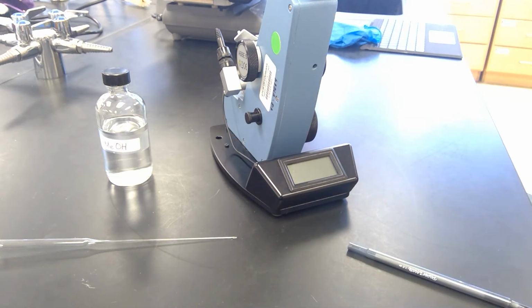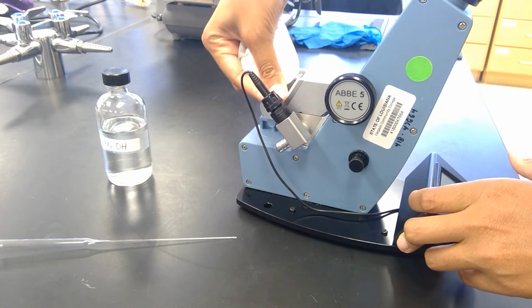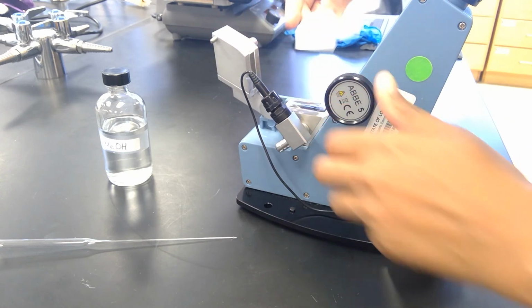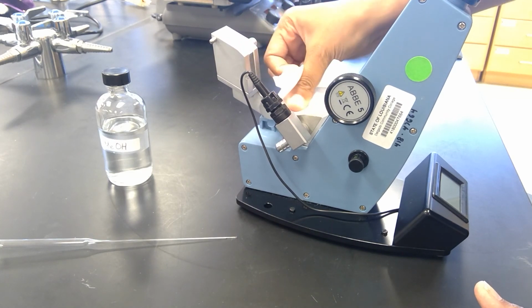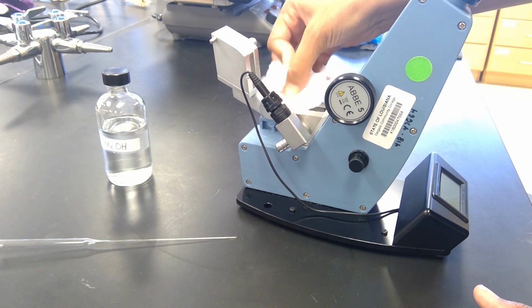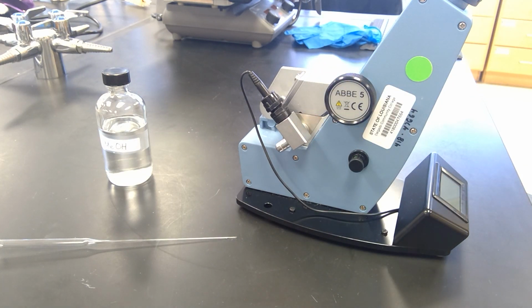So I'll show you how you clean it off. You just want to take your Chem wipe. We're going to close where your light comes in. We're going to open and we're going to wipe the inside with the Chem wipe. And that is how we use the refractometer.